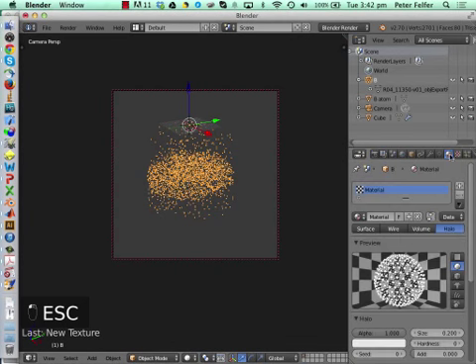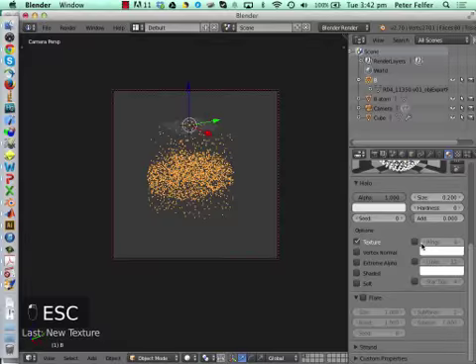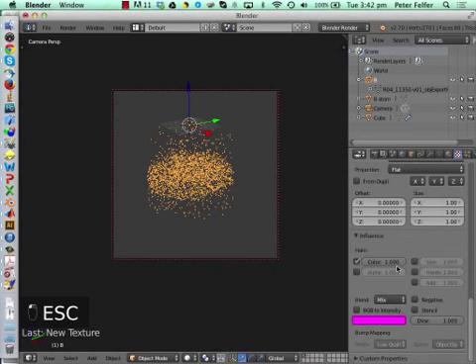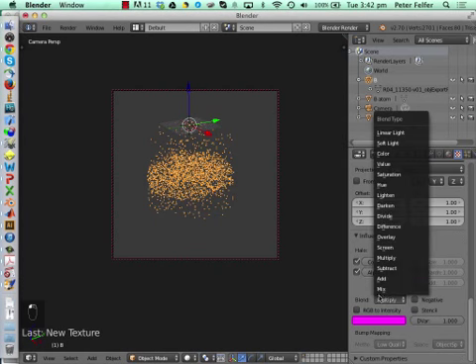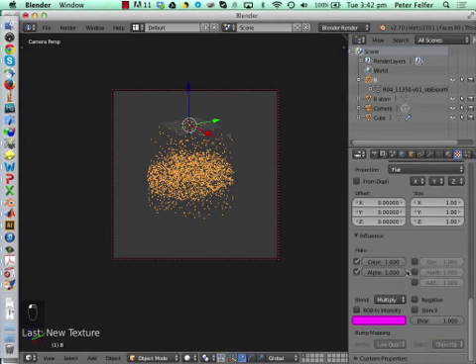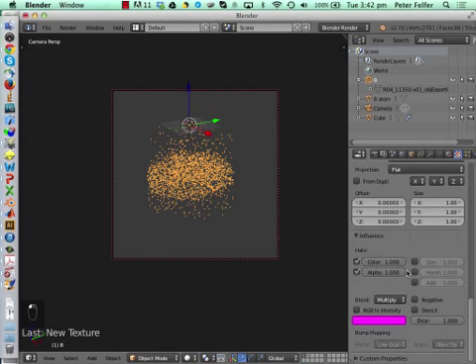And it's still not rendering them out. We'll eventually find out why it's not doing that. It's good that you're all here. And the next thing is influence color, influence alpha, and multiply. Because otherwise, multiply means that we get a black ring, whatever color we put in the middle, and nothing outside. And that's everything here.